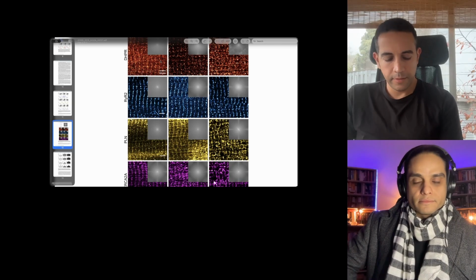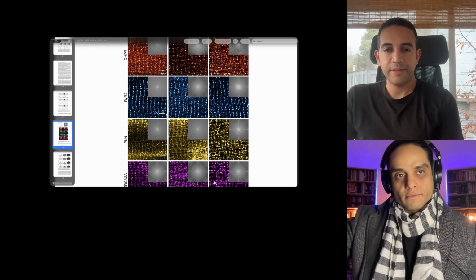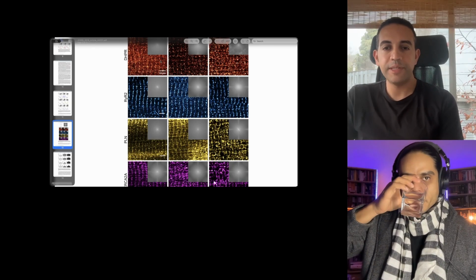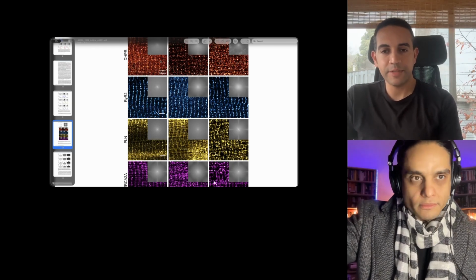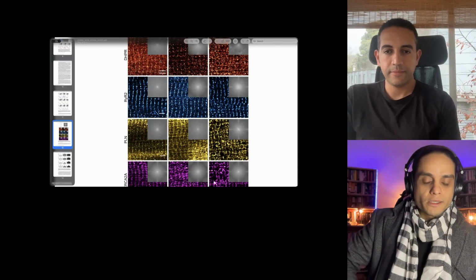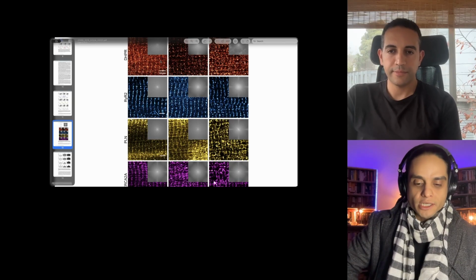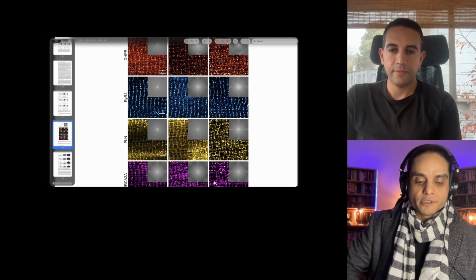Yeah. And what I always tell people when they ask, how do you get such nice images? Well, it's not the microscope. It's that we made sure that the sample prep was as good as it can be. Yes. Yeah. It's rarely the instrument. It's 99% of the time the person that did the experiment.